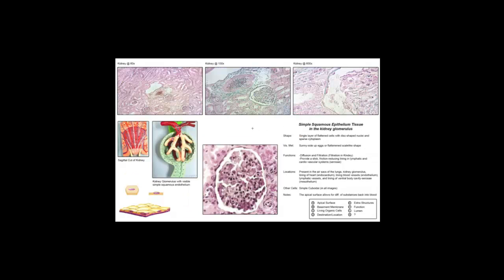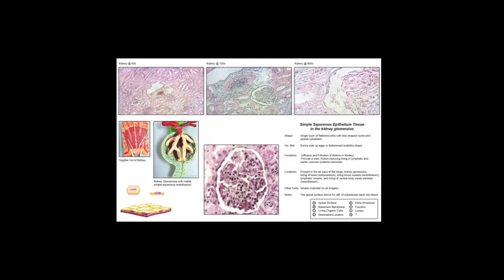Okay, this is the kidney slide. What we're looking at in this picture here and in this picture right here is a larger view, 60x view of one of the medullary region, the medullary pyramid in the kidney. This outer region here is the cortical region where the majority of the glomeruli are found, and this is a low magnification view of each of those glomeruli in that cortical region out here on the outer edge with a number of different kidney tubules, cuboidal lined kidney tubules surrounding it. This would be deeper into the medullary region right here.